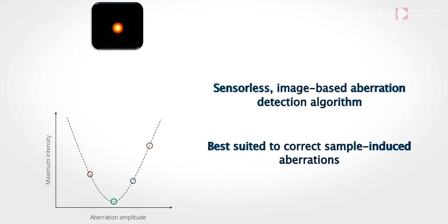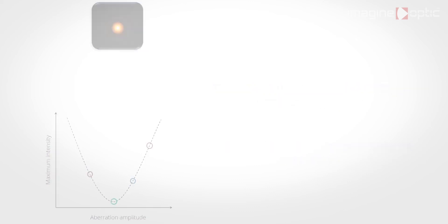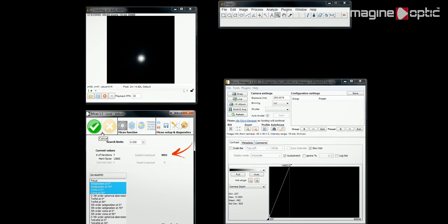This step can take up to 2-3 minutes, but it is very powerful and usually provides the best results you can ever get. In this example, the iterative image-based algorithm improves the signal intensity by 30%, from 9000 to 12000 counts.